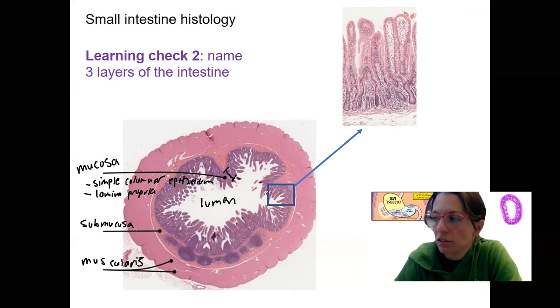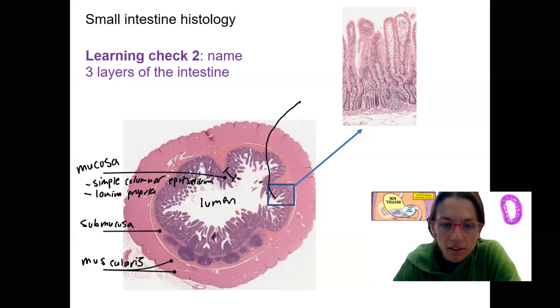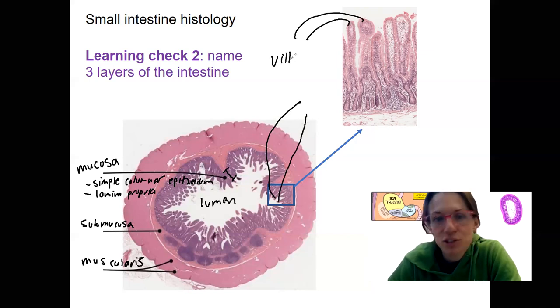What are these little finger-like things sticking out? This one is one, this one is one, and these are each villi. Each is villus, villi is plural. We'll come back to the importance of these. You cannot see microvilli in this view. They're there on the edges here, but these are villi.